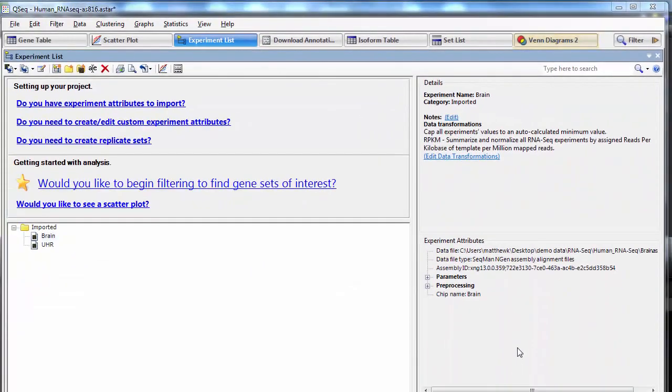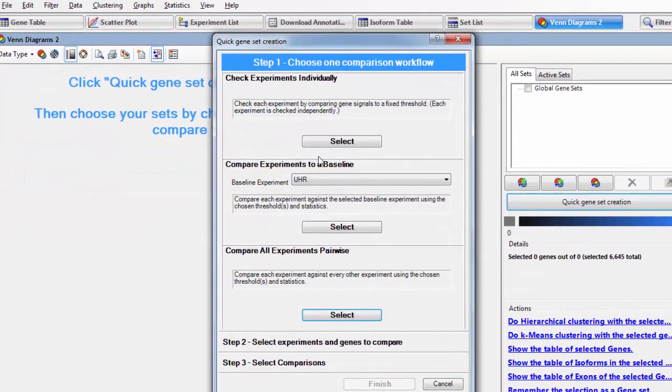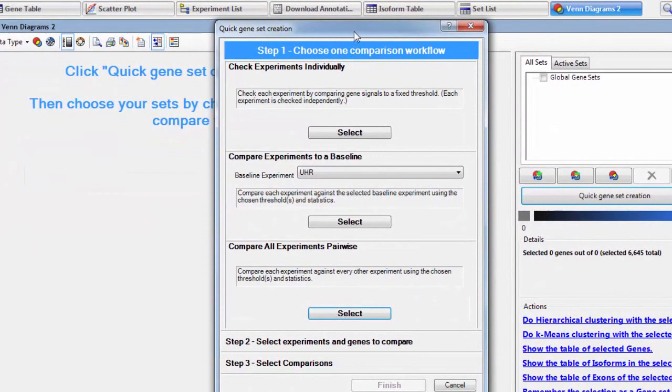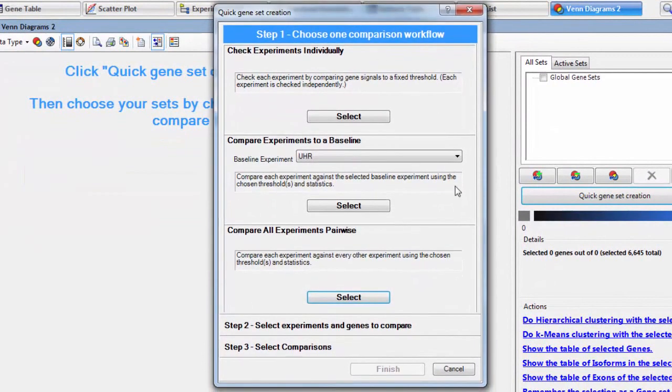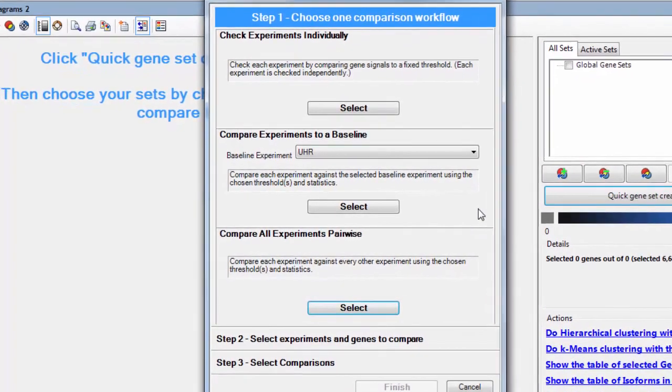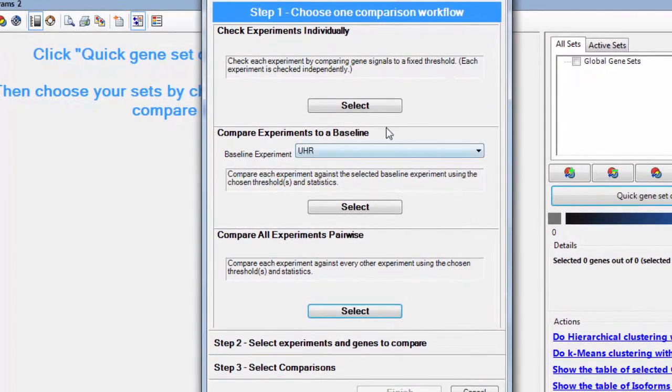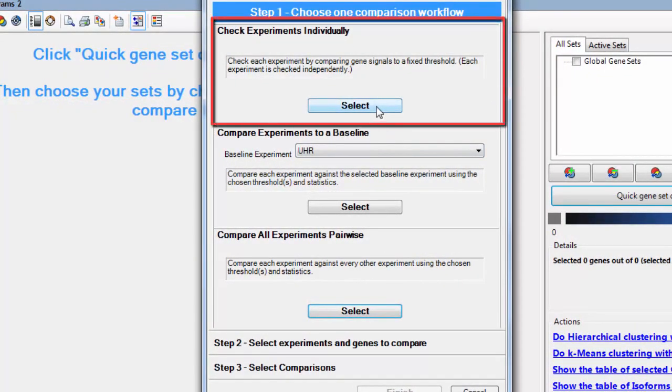From the experiment list view, I can click on this link here, which will bring up the quick gene set creation dialog. I just want to find genes with a high signal value, so I'm going to choose to check experiments individually.